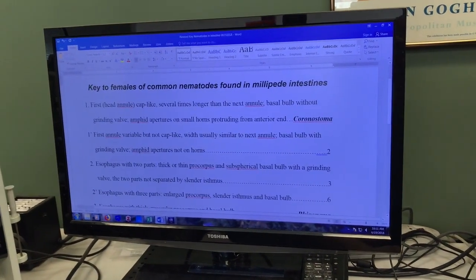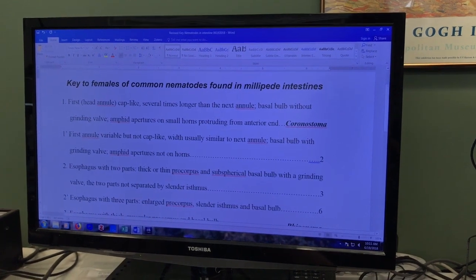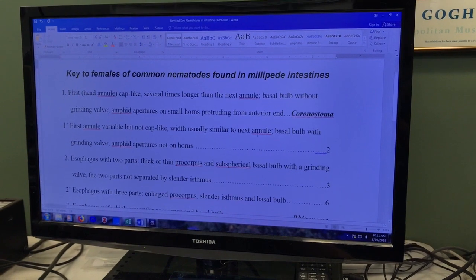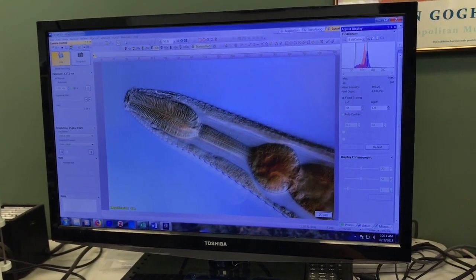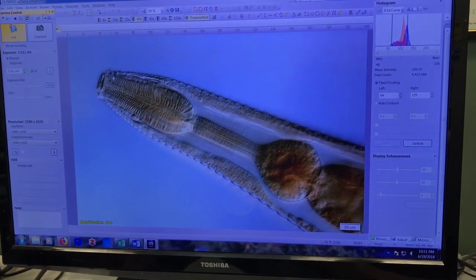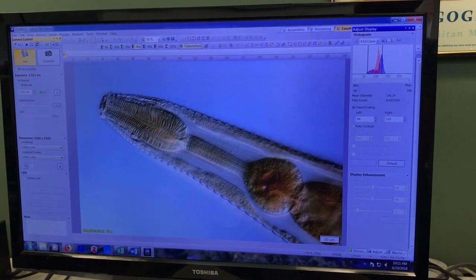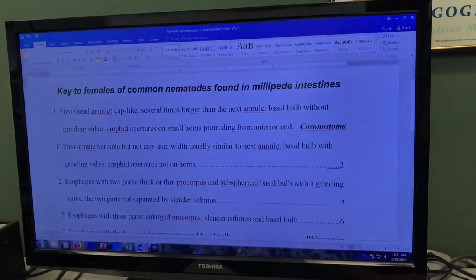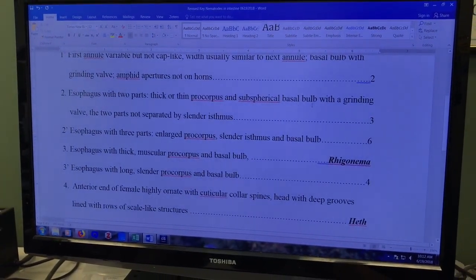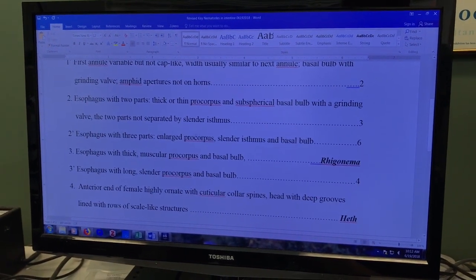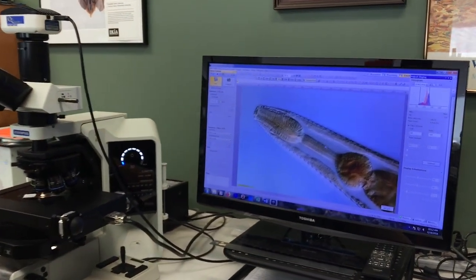Couplet one: the first annual being cap-like with the basal bulb without a grinding valve — that's one option. The alternative is the first annual is variable but not cap-like, usually similar to the next annual, and the basal bulb has a grinding valve. Going back to the picture, the first annual on this nematode really isn't any bigger than the other ones, and there is a grinding valve. So we know it's not Coronastoma and we move on to number two. Couplet two asks: is the esophagus two parts — pro corpus and basal bulb — or three parts — pro corpus, isthmus, and basal bulb? This clearly has three parts: a pro corpus, an isthmus, and a basal bulb.